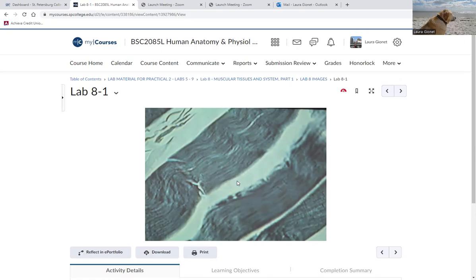That represents the region from sarcomere to sarcomere. And the sarcomere is the repeating functional unit of skeletal muscle. Those are what's called striations. These take up some stain, and you can see these little pencil lines traveling from one side of this muscle cell or fiber to the other. Those are striations, and that represents the end of one sarcomere to another sarcomere. And those sarcomeres repeat all the way down the length of this entire muscle cell or fiber, and then you have many, many, many thousands of them.